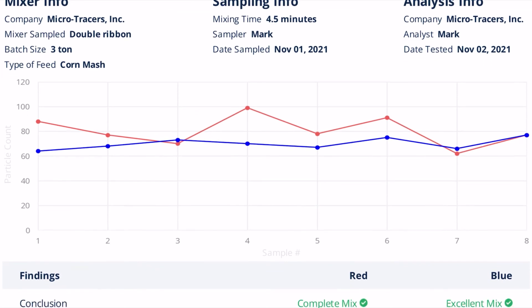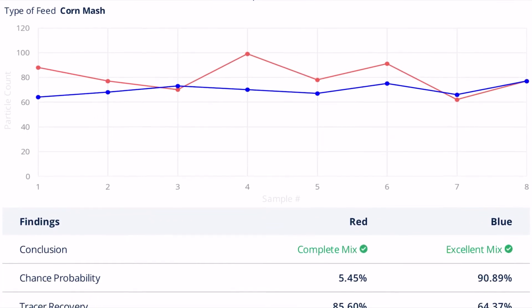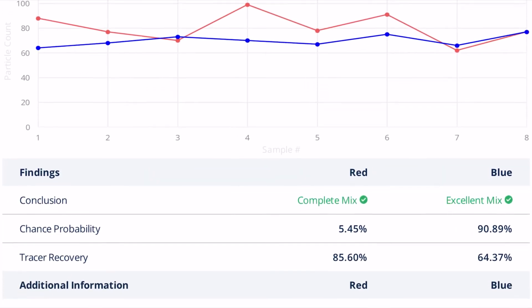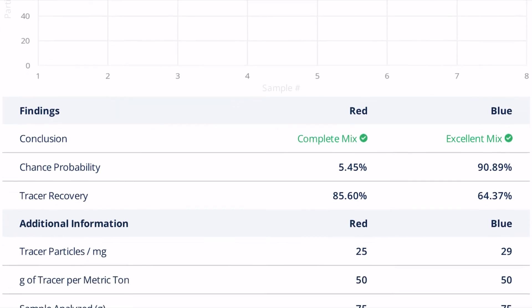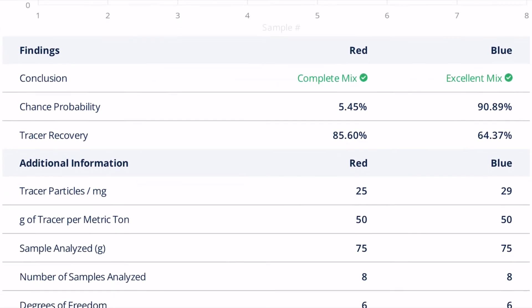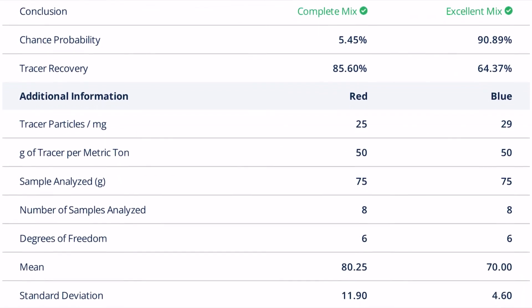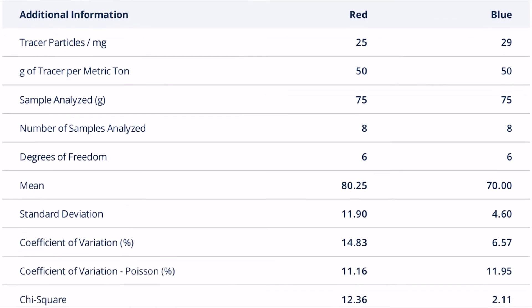You now have quantitative data on the amount of Microtracer in the feed sample. For mixer studies, compare Microtracer counts from multiple feed samples to determine the completeness of mixing of the feed using the Microtracers web portal or mixer testing software.